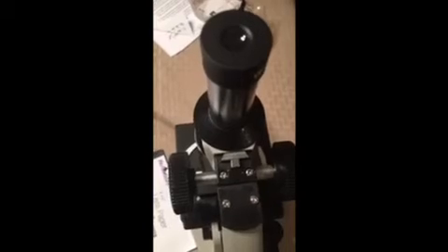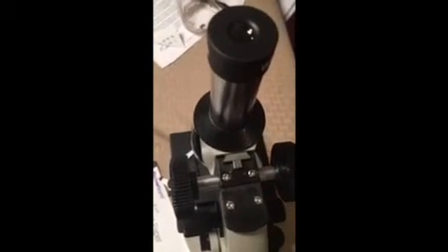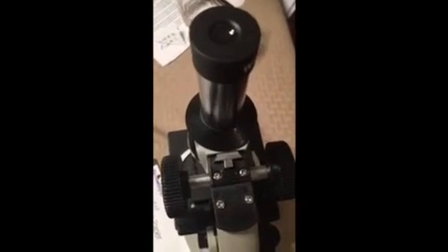So 2 for 2. I already viewed the S. cerevisiae, and I best saw the image with the high power lens. Now we're doing the S. epidermidis, and it's the same thing, it looks best with the high power lens. Let's see if we can try to see. Oh yeah, you can kind of see it.